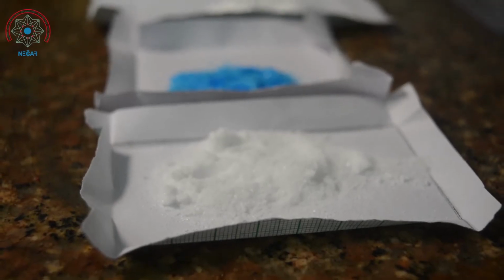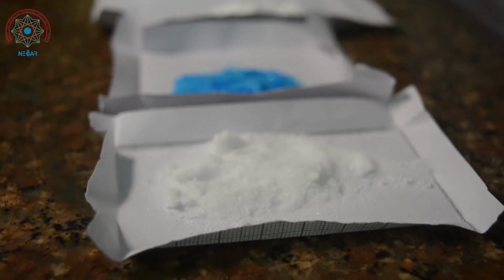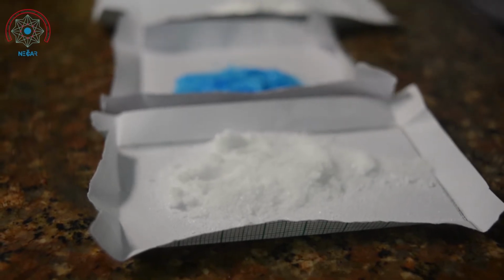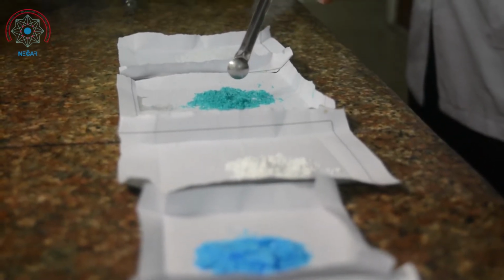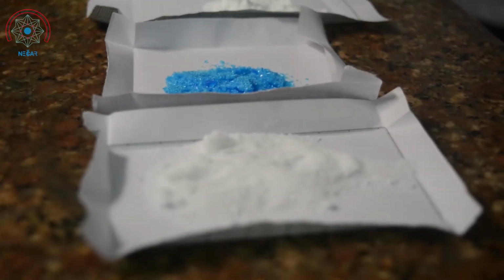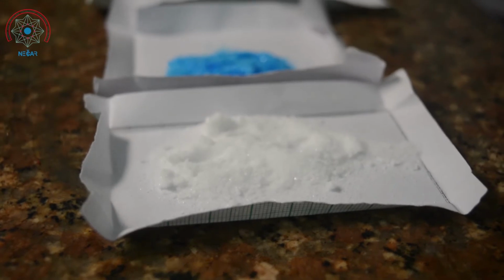In the first step, we have to observe the physical state of these compounds and the color. Here, if you observe, this is white, this is light blue, this is again white, and this is light green. Now we can write that down, along with the physical state, whether it is crystalline or amorphous.